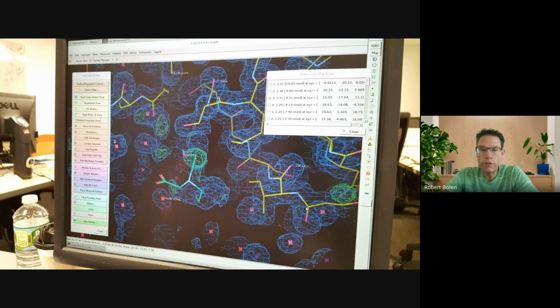And so students and teachers, you will all learn how to do this, where you'll actually manually adjust this yellow backbone of the protein to fit these clouds so that we have an actual structure of the protein based on that. And then the little X's here that are red, those represent water molecules. So these little round spheres are basically where there's a lot of water. And proteins are surrounded by water. They exist in a watery environment. And the solutions that we mix them in, they have water in them. And so it'll freeze up, and so we'll see that. And so we can determine what's water and what's not based upon what we have in there, okay?